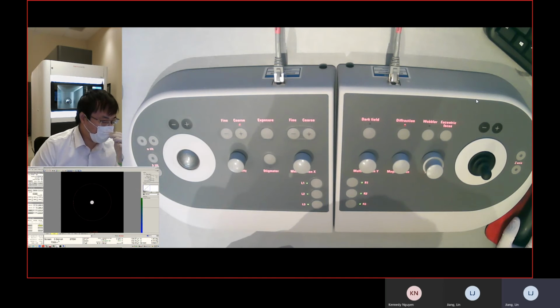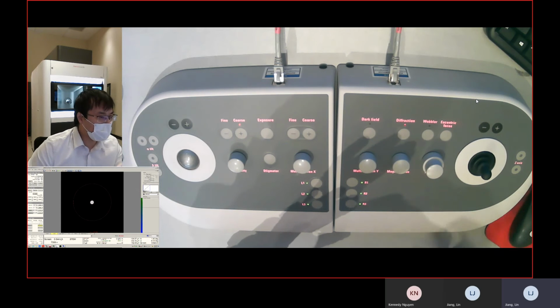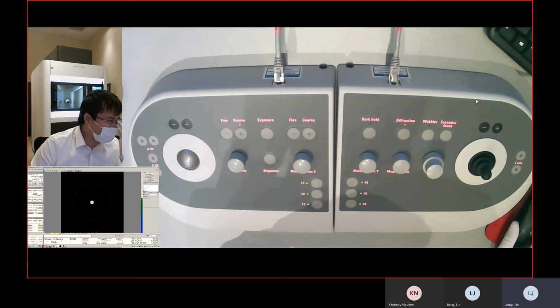So today we're gonna do just normal STEM imaging. We want a better contrast, so we want more current. More current means more signal goes into our detector, and we have a better contrast in our imaging. So to do that, we can just change the spot size.